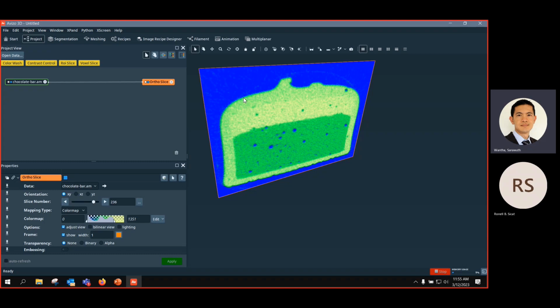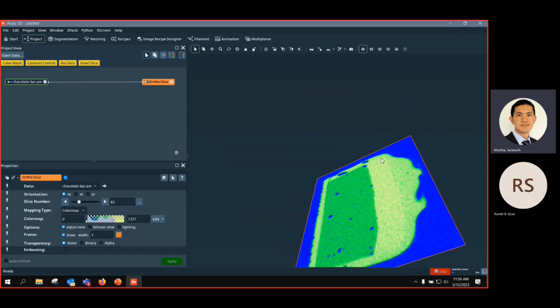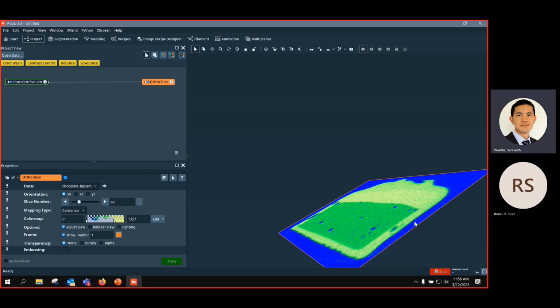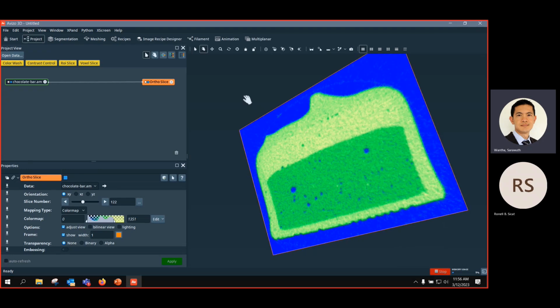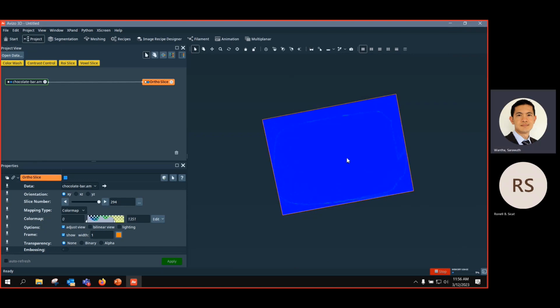Why? Because sometimes you need to, for example, when you want to do image registration. So you want to move them, and then you want to turn them, move them, and turn them like this. So it's easier to press this escape key to switch between these two modes. Otherwise, you have to go to the icon all the time. But as you like, if you feel more comfortable to click each time like this, click, move, and then click, that's also possible. But it's easiest to use this escape shortcut to change between the two.